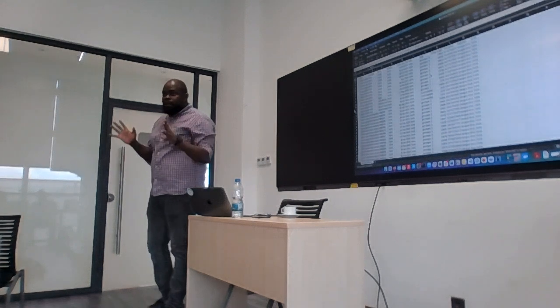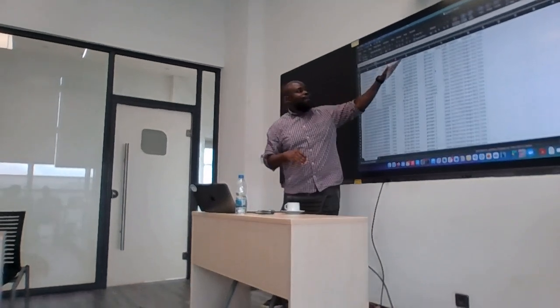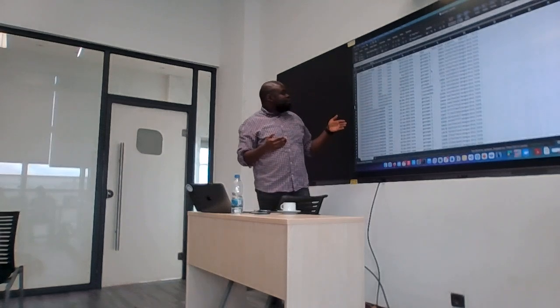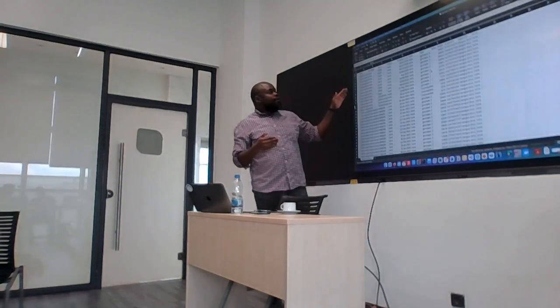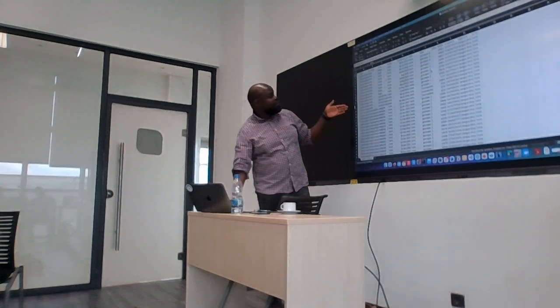We are back. So remember I said, for me, the reason why I download the full GenBank file is so that I can get additional information about the sequence. So that it's easier for me to say, okay, I only want sequences that are human. I only want sequences that are from a given country, right?